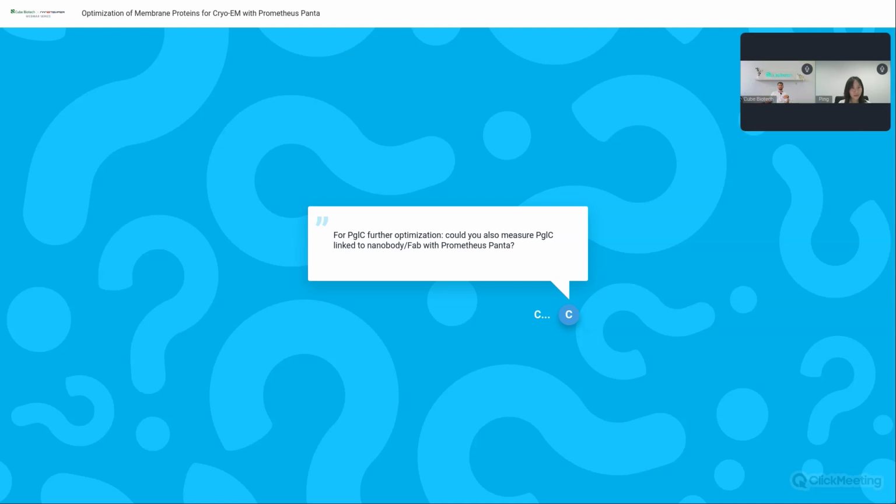Okay, we have more questions. Oh, we have so many questions, it's crazy. From Biotech. PglC further optimization. Could you also measure PglC linked to nanobody FAB with the Prometheus Panta? It's a good question. Did you do that? Yes, I think in theory you could. I'm not sure if you would have done that in your lab. No, we have not done this.